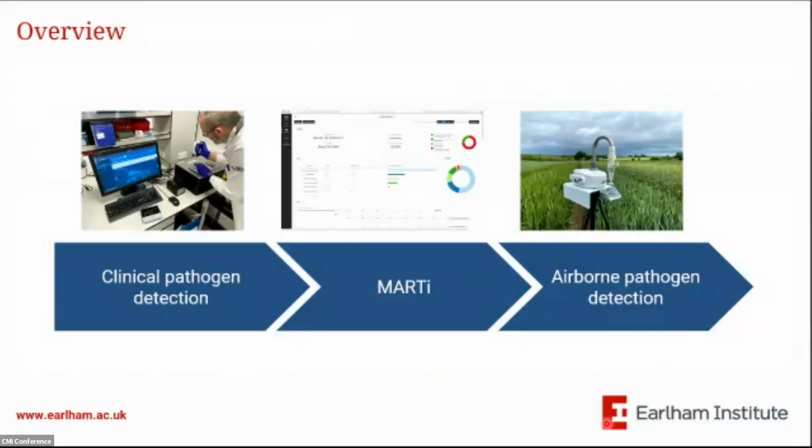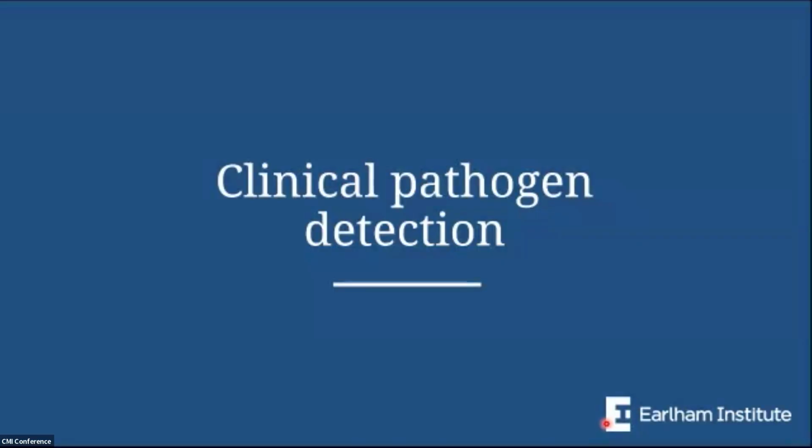What I wanted to talk about today is two bits of work in pathogen detection, and they're linked by software. The underlying story over the next few minutes is the development of a software package, with these applications as a way into that. I'm going to talk about some clinical pathogen detection work that we've done in the past and are continuing to do now, then how that led to the development of this tool called MARTI, and then airborne pathogen detection work that is also being enabled by MARTI.